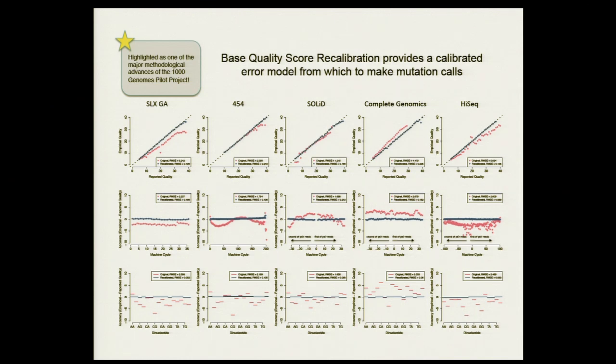Okay, and then you may think, these are really old technologies. What about very new technologies? So maybe this one or this one. And you can see that it's still quite terrible. In fact, these people have added something to their quality score estimation procedure to create this crazy 5-cycle periodicity bias in their quality scores, right? Maybe you can't see it so well, but these dots go up and then reset and go up again. That's why they're very wide here. What's happening is that every 5 bases, they reset their Gaussian mixture model or whatever they use. And so they've created this bias in their quality score estimates as a function of machine cycle. Does that make sense?